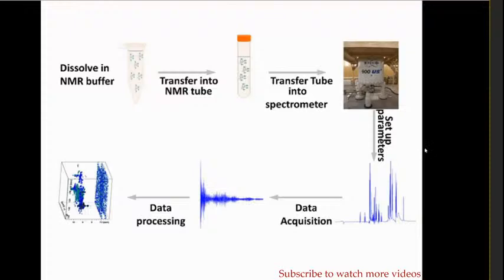this kind of peaks. These peaks undergo data acquisition. Data acquisition means it's converted into signals. These signals help to produce the protein structure image. Here these peaks are the atom peaks, with this much height. The peak helps to understand the position of the carbon atom and hydrogen atom, and it helps to produce the data acquisition. After obtaining the acquisition, we develop the image for the protein structure.